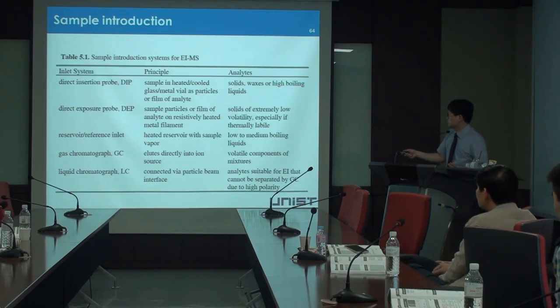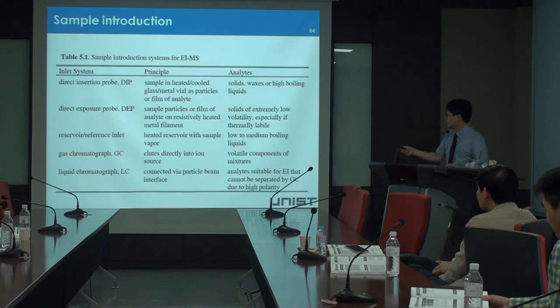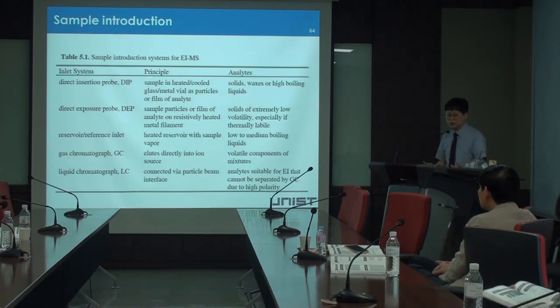Next are the sampling options, DIP and DEP. These are not widely used. For solids, waxes or liquids, you can use these. But our general option is GC or LC.